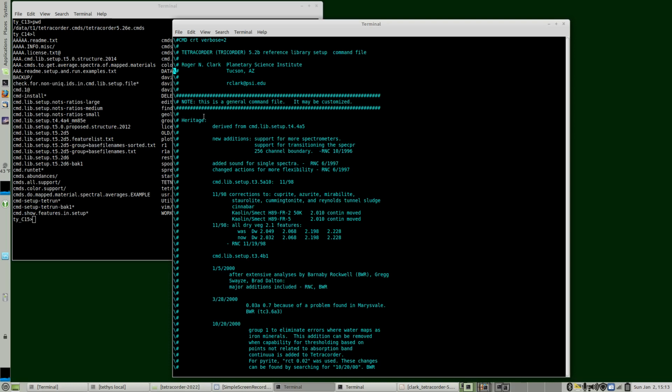The SpecPR free format IO routines are used to parse this file. So in SpecPR, a # sign is a comment. If the # is the first two characters on a line, that line is completely ignored. If it's not the first two characters on a line, it'll parse that line looking for commands to execute.